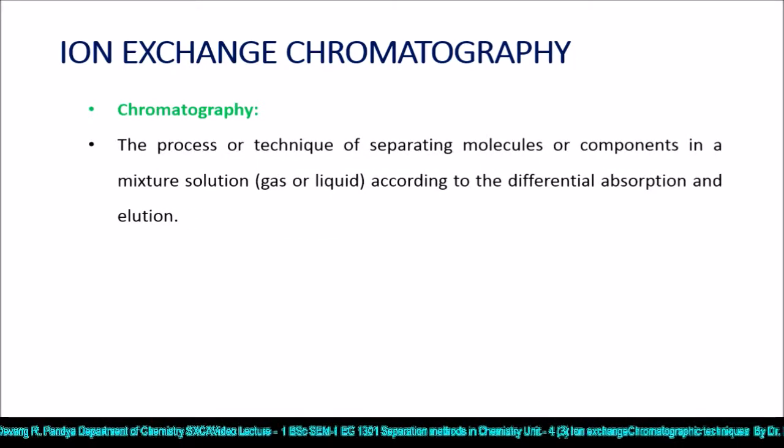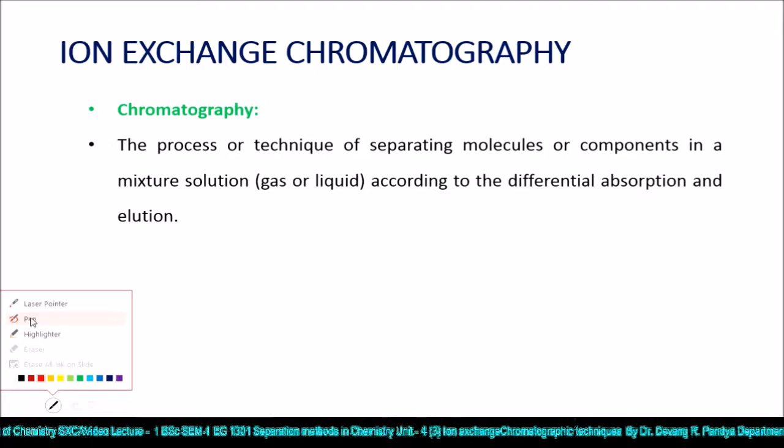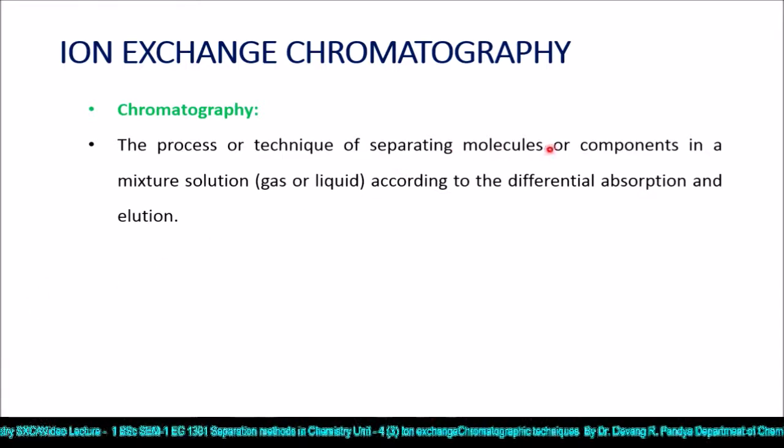The process or technique of separating molecules or components in a mixture, solution, gas or liquid, according to the differential absorption and elution is known as chromatography.